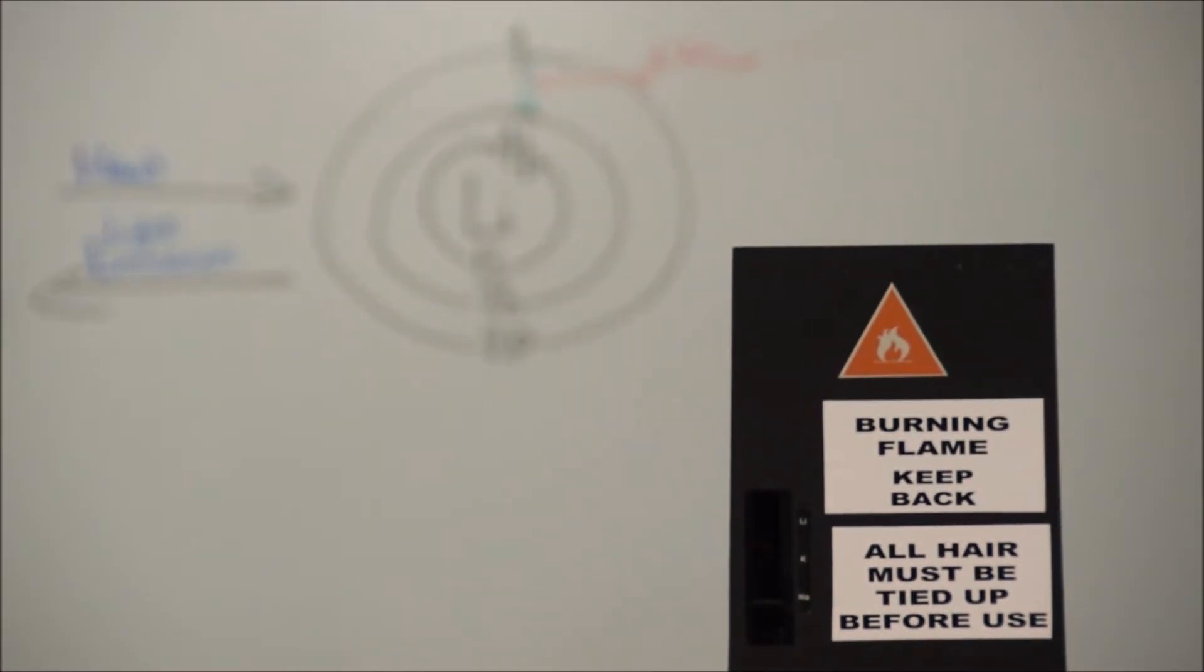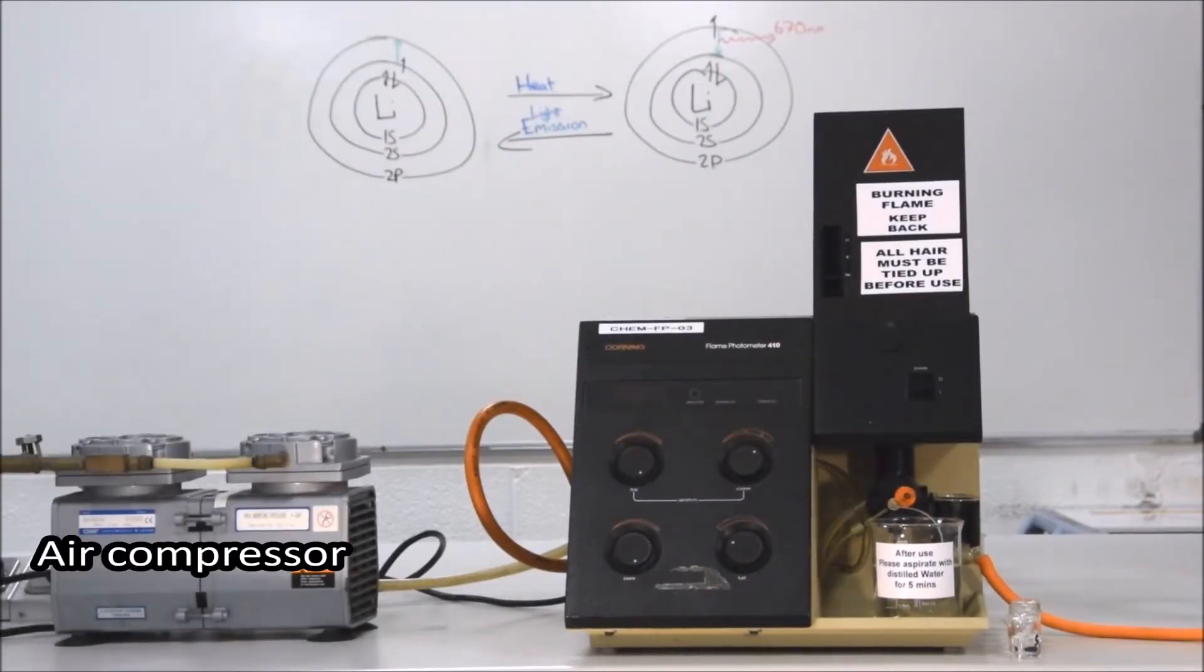With those safety precautions in mind, let's have a look at the basic operation of a flame photometer. The first thing we turn on is the air compressor. The air compressor provides a consistent supply of air and also allows for the sample intake to operate correctly. Therefore you must turn it on before operating the machine.